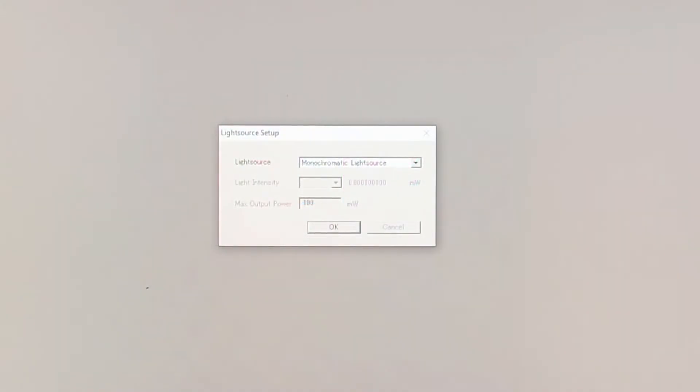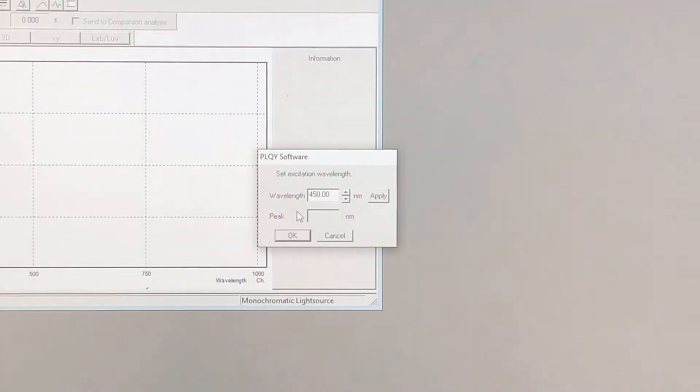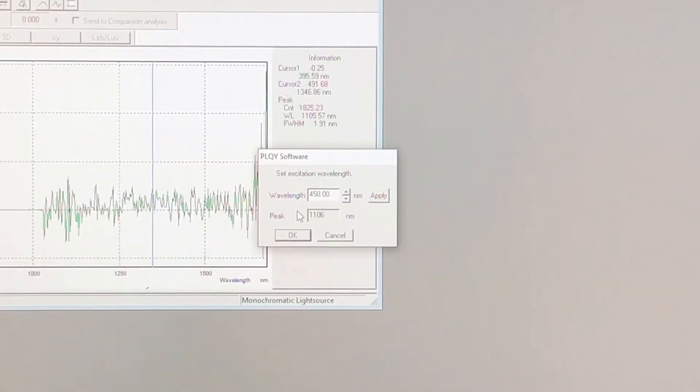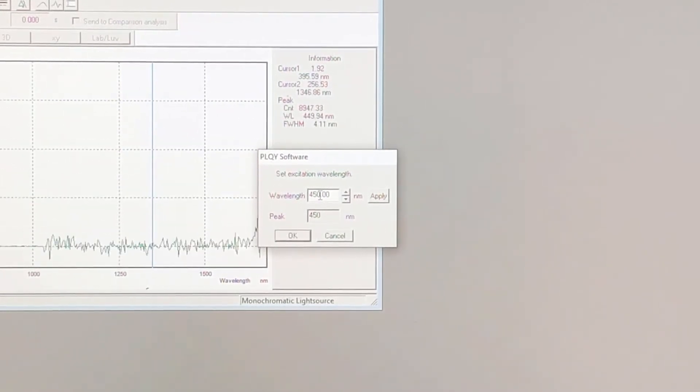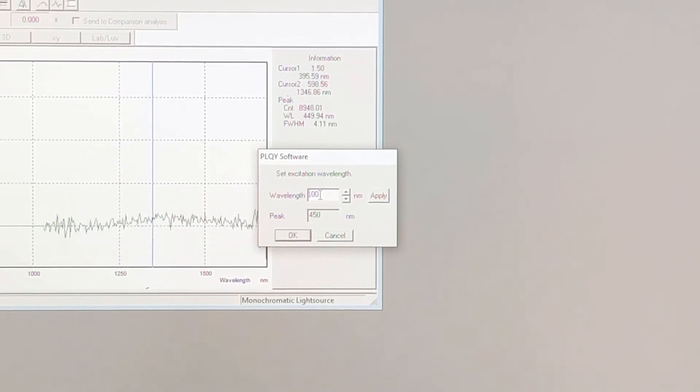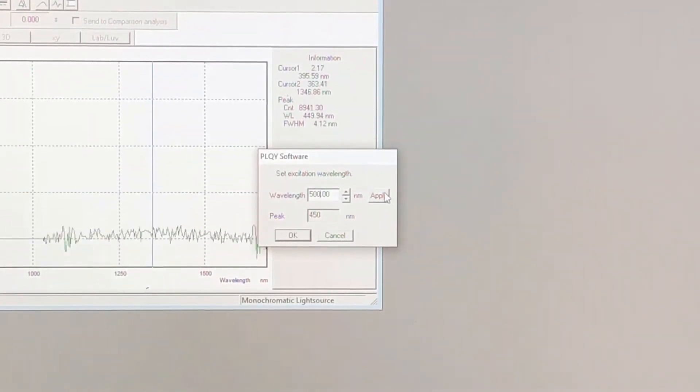Let's load up the software. We'll choose the monochromatic light source and select single scan. When it asks for the excitation wavelength, we'll use 500 nanometers, which is near the absorption peak for our material. Remember to hit apply before selecting ok.